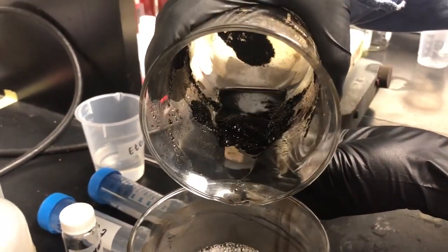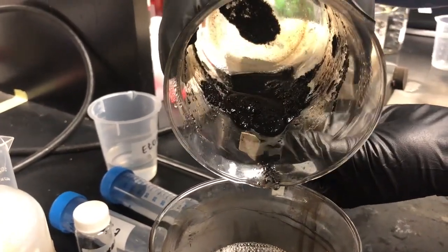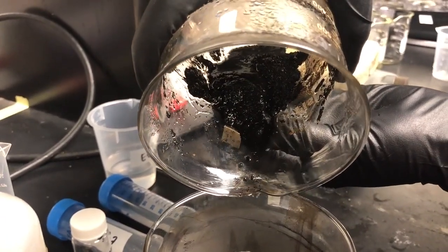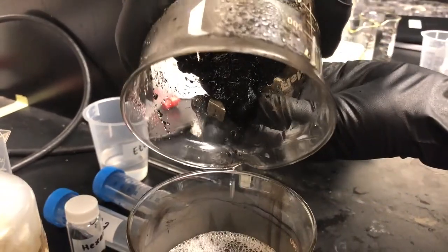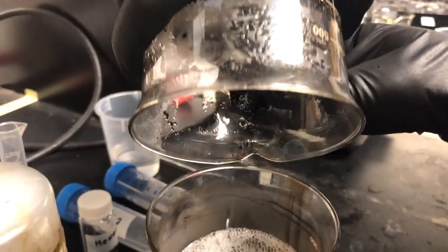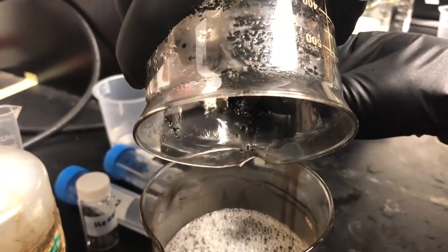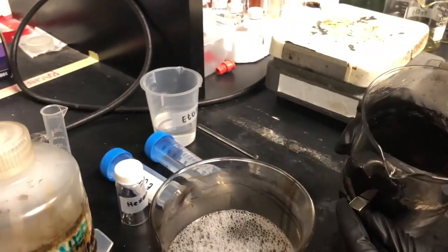So we're going to make sure we invert the beaker completely at each step. And so there you go. You see we lose some. There we go. All the way inverted. And once it's completely inverted, we've removed now all of our water-soluble contents. That's our iron chlorides and our ammonium hydroxides. Next, let's move on to the ethanol washes.